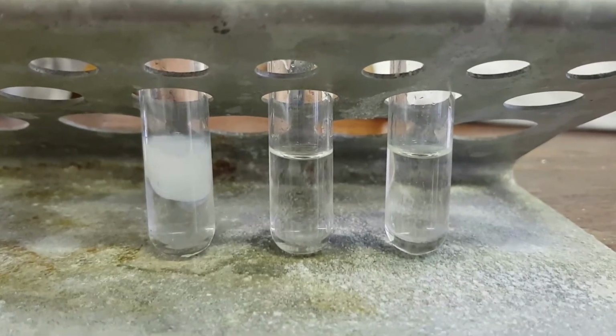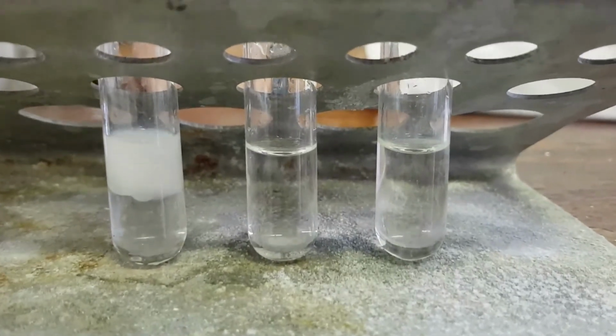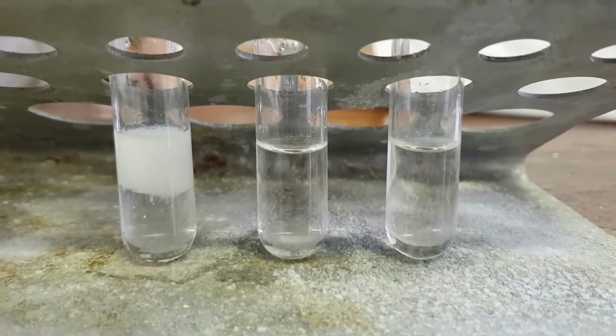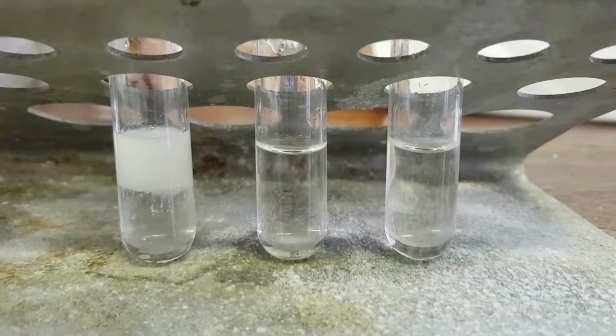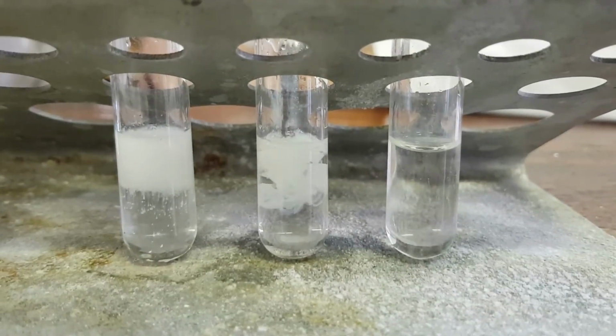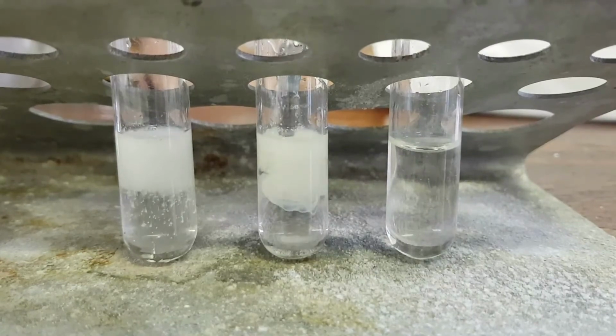And we can see a lovely white precipitate being formed when silver nitrate solution is added to a chloride, in this case potassium chloride. Now for the bromide.